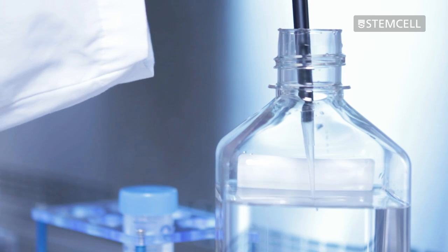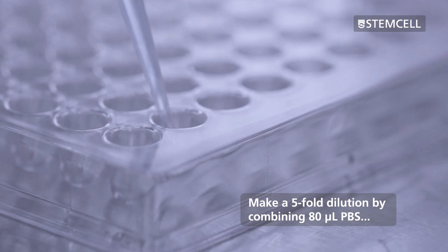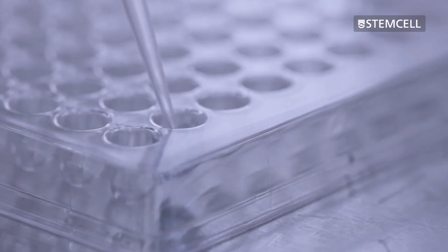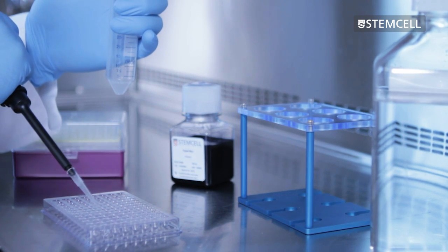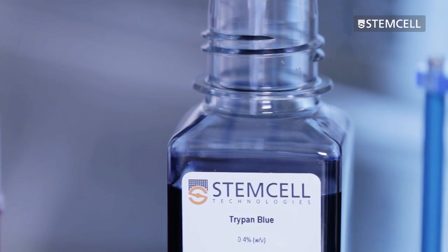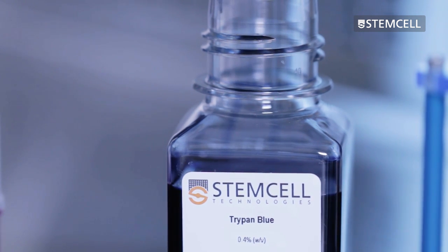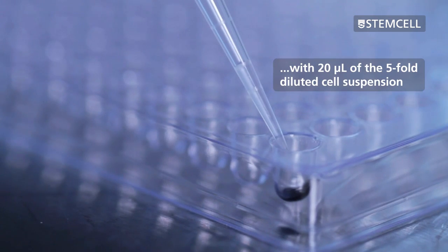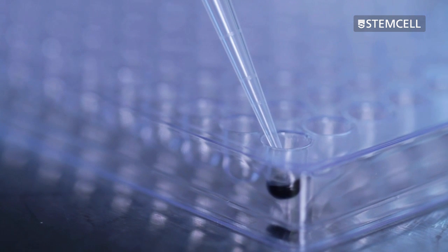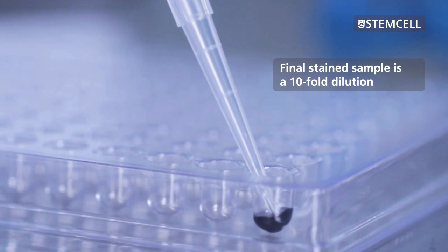Dilution should be carried out in two steps. First, make a 5-fold dilution by pipetting 80 microliters of PBS or serum-free medium into the well of a 96-well plate and then adding 20 microliters of well-mixed single-cell suspension to each well. Next, make a further 2-fold dilution in a new well in the 96-well plate, combining 20 microliters of Trypan Blue solution with 20 microliters of the 5-fold diluted cell suspension. This yields a final 10-fold dilution of the starting sample.